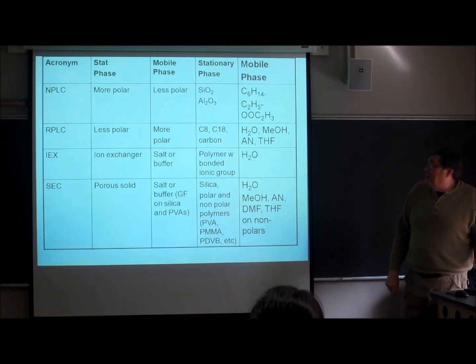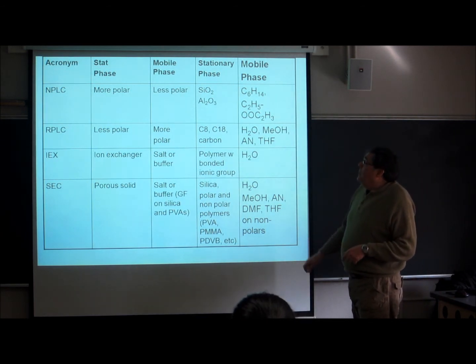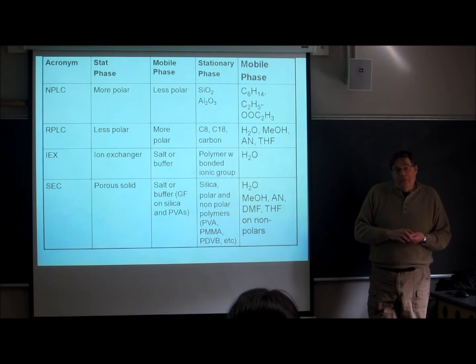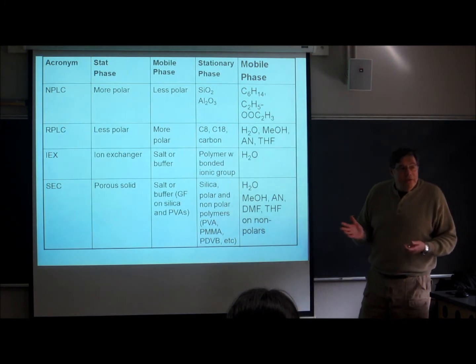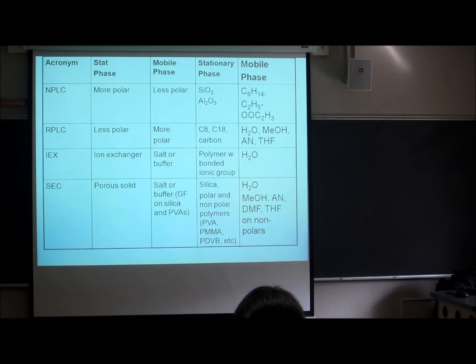All right, now I'm not going to belabor this. It will be on the web. I'm going to give that to him to put on. But I do want to point out one of the advantages that HPLC has over gas chromatography. And that sounds odd and out of left field. Sorry. In gas chromatography, the separating ability of a column really depends on the nature of the column material, but not of the mobile phase.